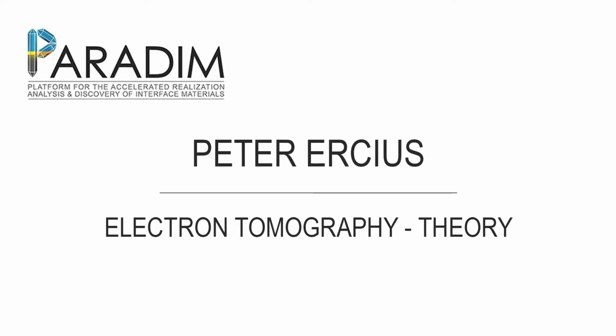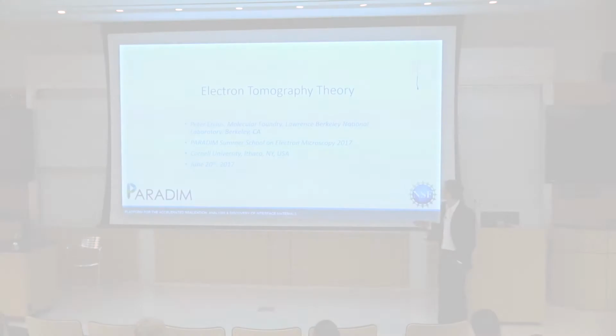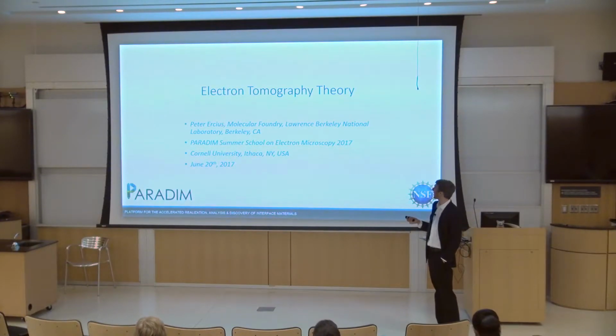Okay, so we're going to talk about electron tomography theory here. I'm going to start a little bit with why do we even want to do this. And you all know me.